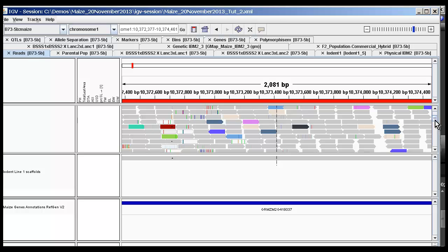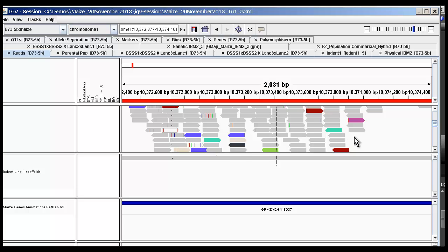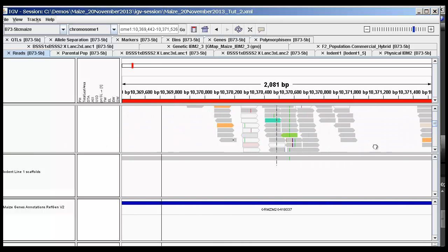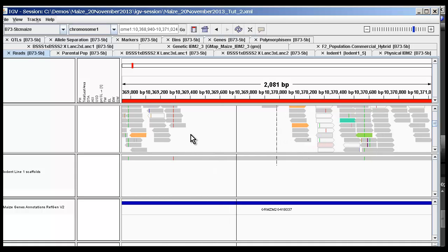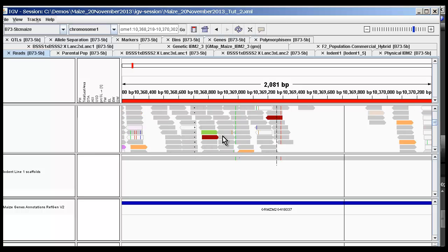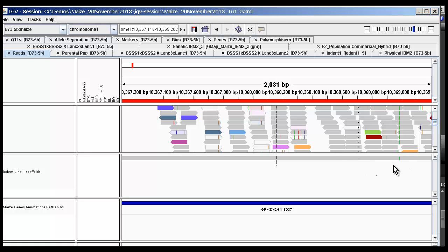So in this case, for example, you'd see a lot of possible polymorphisms, so differences in the color between the reads and the genome, meaning differences in the read sequence or small insertions or deletions that do not really appear in the final decision of what is the sequence of this iodent line. Okay, so one needs to be sure that it filters out the right information before it decides on the right polymorphism that is the base for the haplotype decision. So in this case, a lot of those false possible polymorphisms will be filtered out and only a few were left.